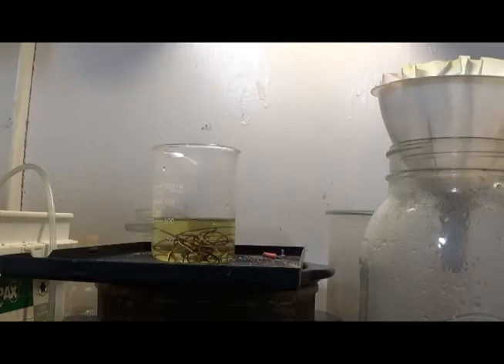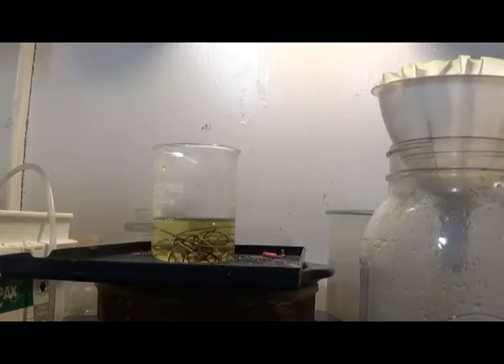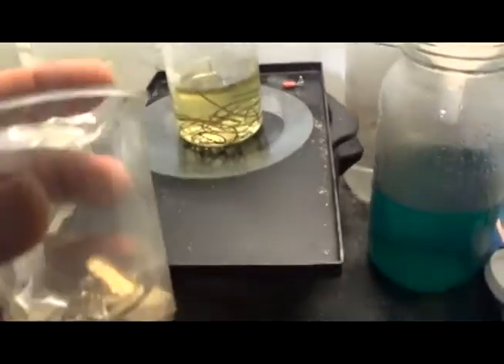We eat up the rest of the copper — the rest of the base materials that might be in this right here. It's looking very good; it didn't explode this time, which is awesome.